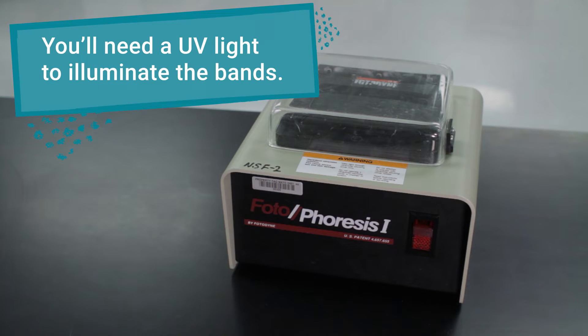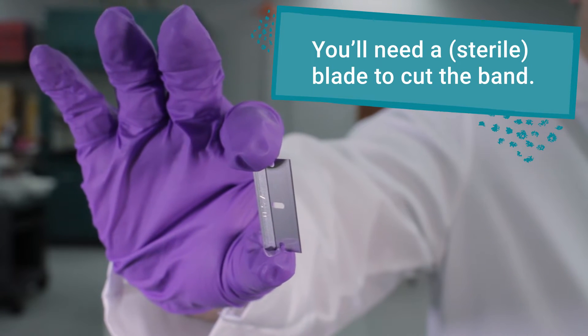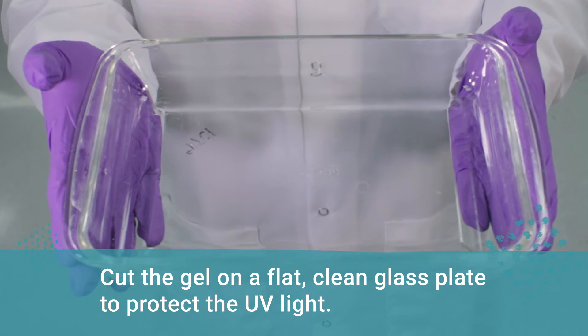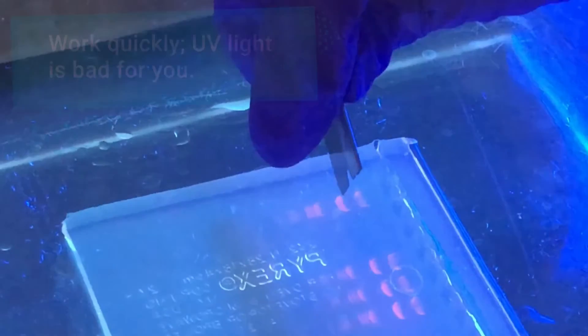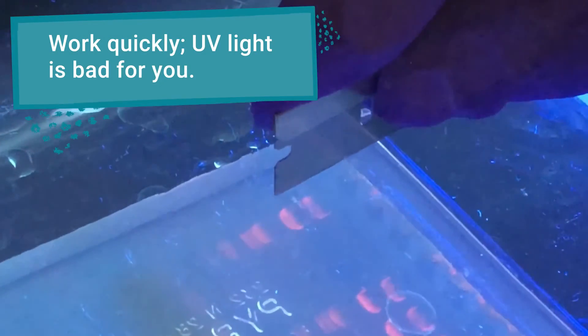To do this, you will need a UV box and a fresh sterilized blade such as a scalpel or razor blade. You should also work on a clean, flat glass plate so that you don't damage the UV box. Be sure to work quickly to minimize UV exposure, which can harm you and your DNA sample.